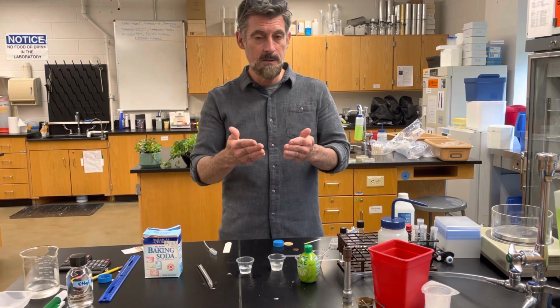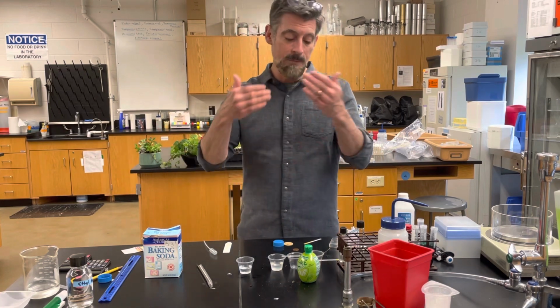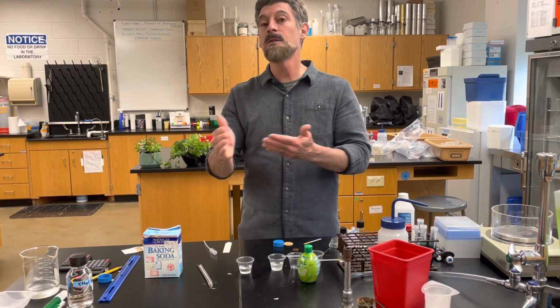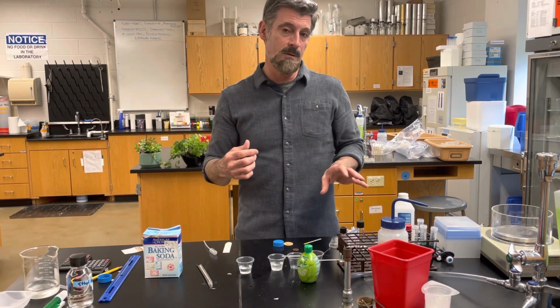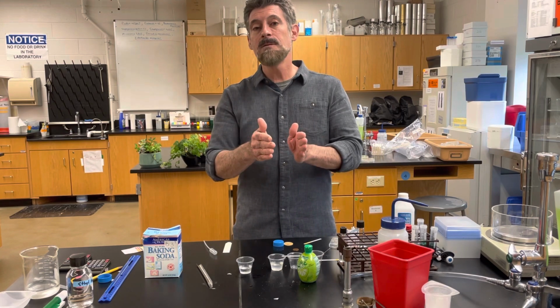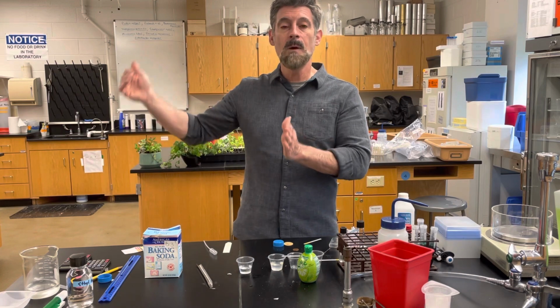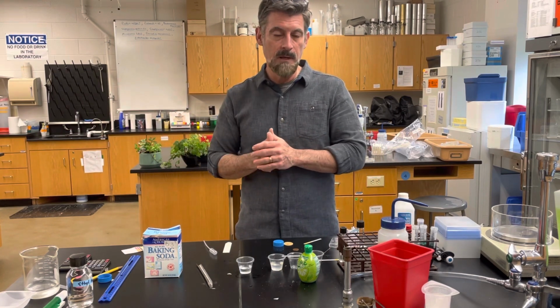And so what you're going to do in this at-home part of the lab is first get your own tap water, and we need to find the starting pH value. And then we're going to try to change it. You're going to lower the pH and raise the pH. You're going to have 6 test strips to do this with, and in the end, you're going to just report out what you used to change the pH and what the end resulting pH was. And then there's going to be a couple pH problems to do.